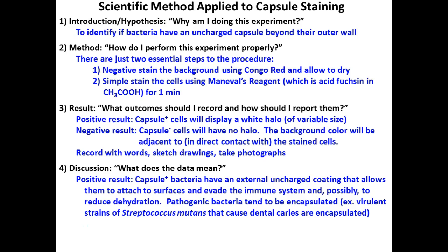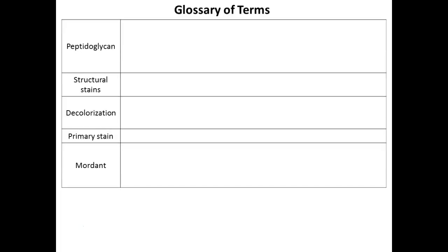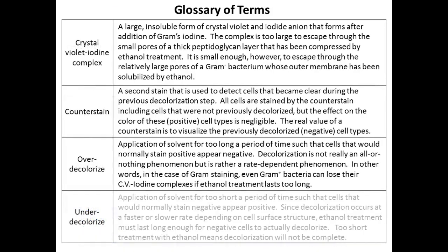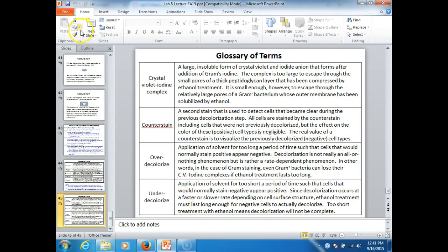And negative ones, of course, don't have a capsule, and usually aren't pathogenic. So then I have my glossary of terms for you guys, which I'm not going to go over, but it's there. This PowerPoint is available now, and the recording will be available later.